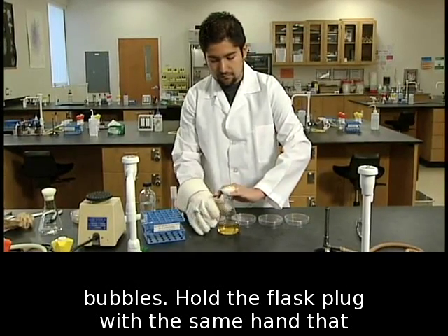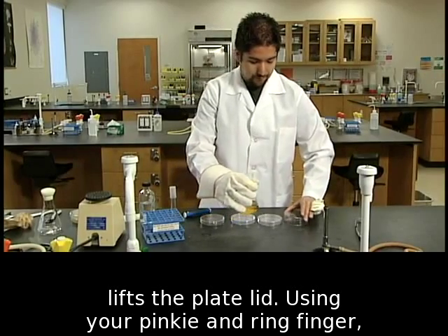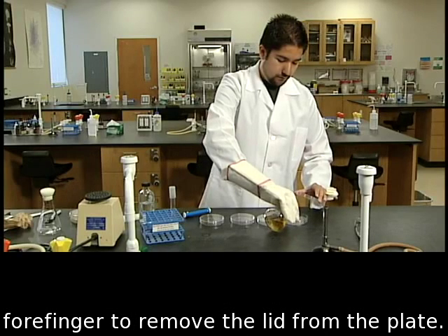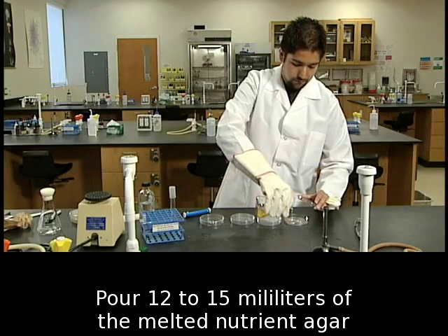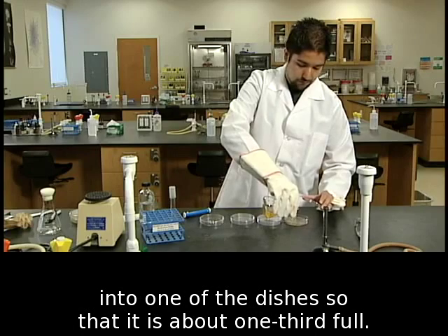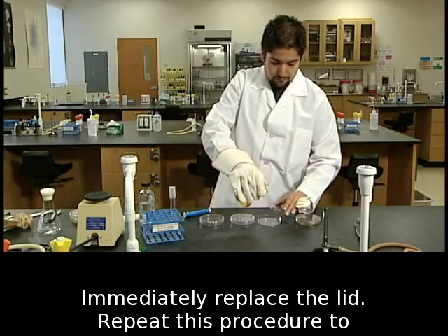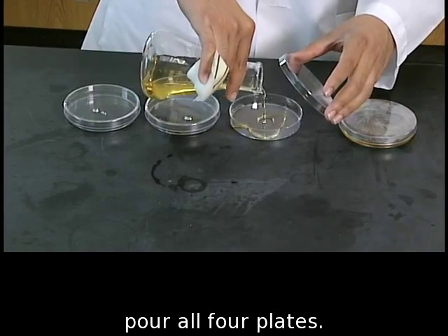Hold the flask plug with the same hand that lifts the plate lid. Using your pinky and ring finger, remove the flask plug, then use your thumb and forefinger to remove the lid from the plate. Pour 12 to 15 milliliters of the melted nutrient agar into one of the dishes so that it is about 1/3 full. Immediately replace the lid. Repeat this procedure to pour all 4 plates.